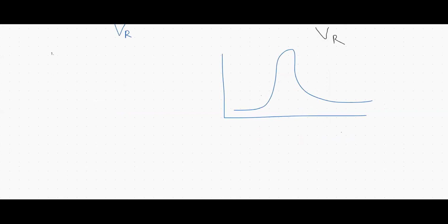Of course, Unicorn just does this for us, but we have this would be max peak height. We'll call it 100. And then this would be 0. And then somewhere there's a 10% max peak height.